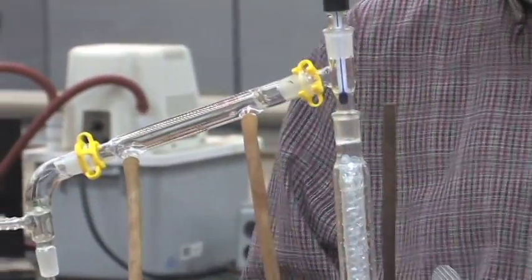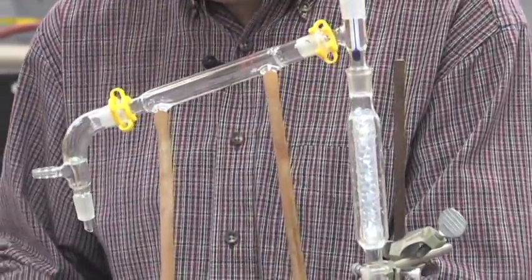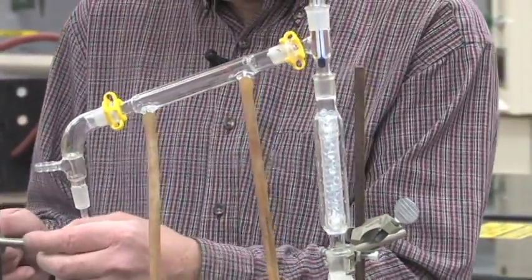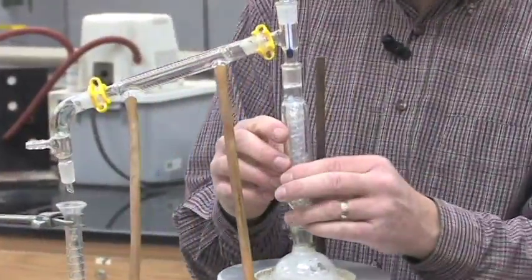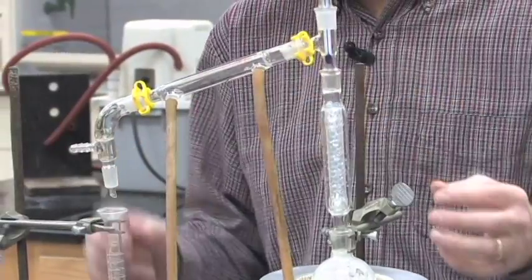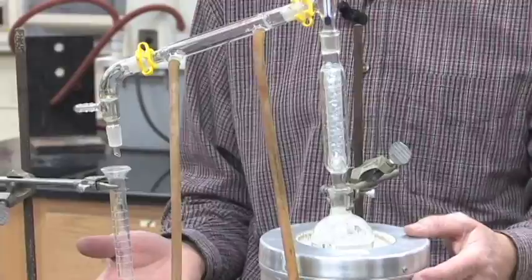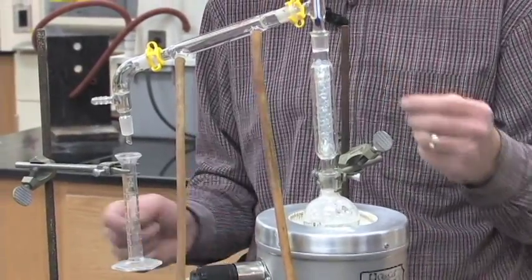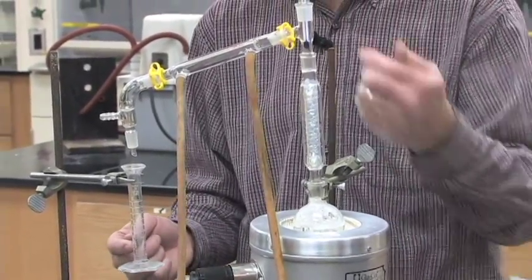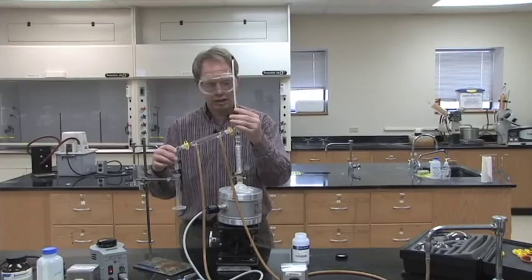As our stuff distills, we'll collect it into a graduated cylinder. You all have a graduated cylinder in your drawer. What you'll do is every milliliter that comes across, record the temperature on the thermometer.